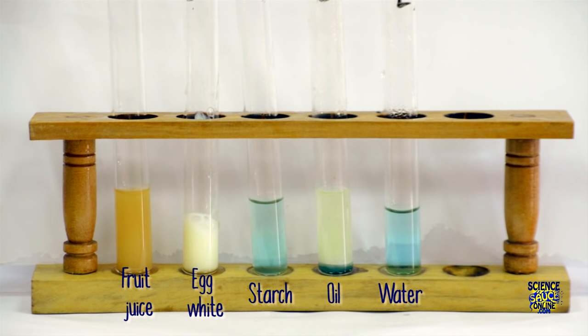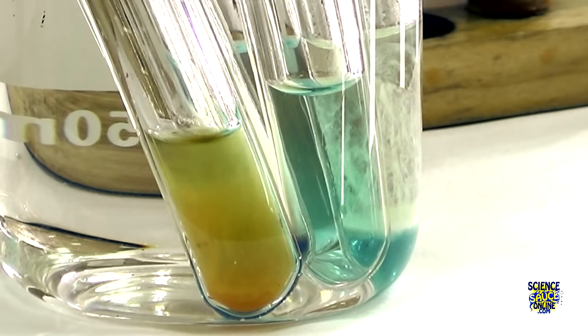When we put them back into the test tube rack we can see that fruit juice is the only one that's actually reacted to this suggesting that it contains reducing sugars.